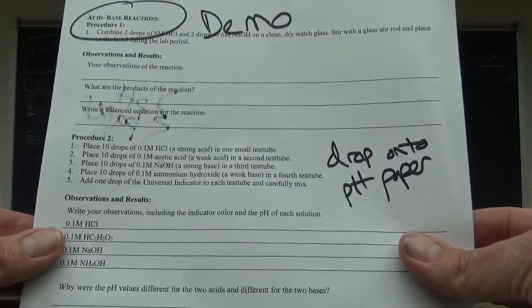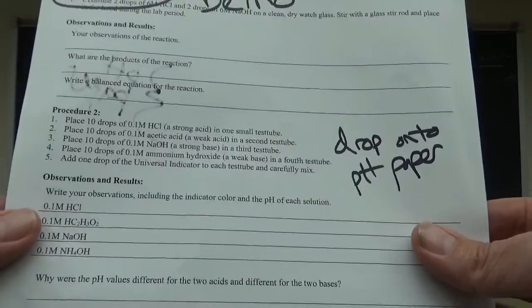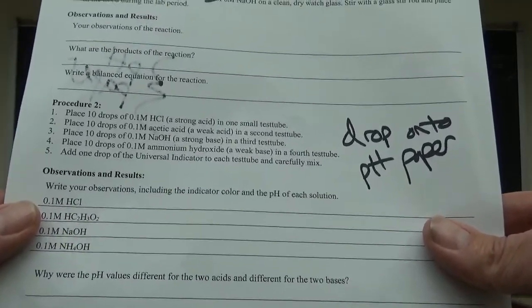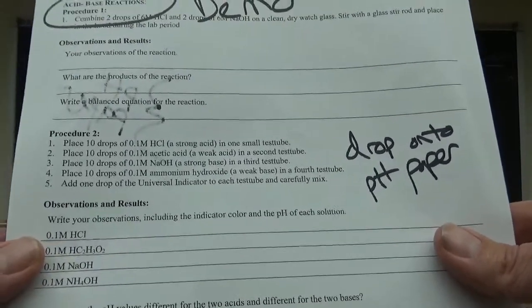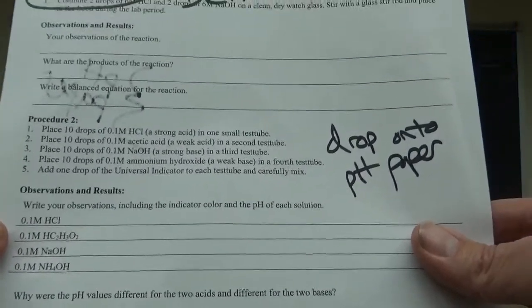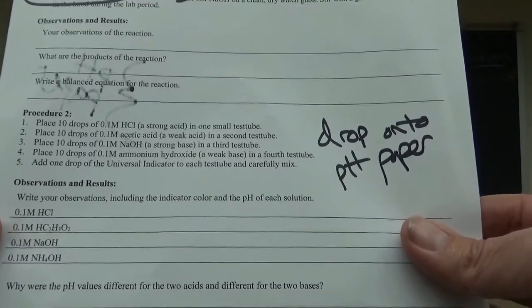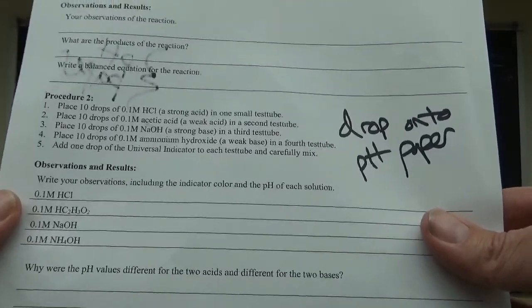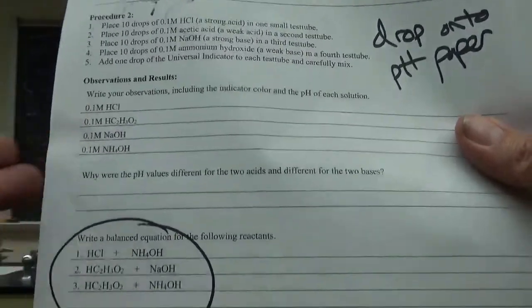Procedure number 2 tells you to take 10 drops of those different solutions. I don't know if you've done the 0.1 M. That's called molarity, moles per liter. The point there is all of those solutions have the same concentration, but they're different acids and bases, and your job will be to figure out what makes them different. Instead of doing this, it'll be a lot faster if you just tear off little pieces of pH paper and put them on a piece of paper towel, and then drip some of the different solutions on there, and then match up the color to tell how strong of an acid or base it is. But I'm getting ahead of myself.